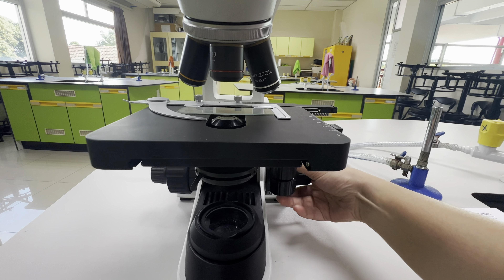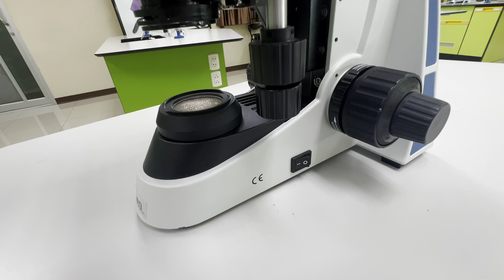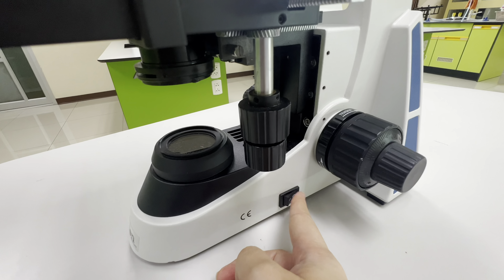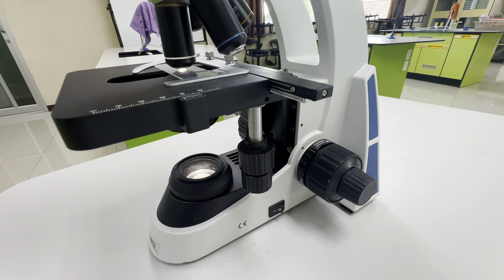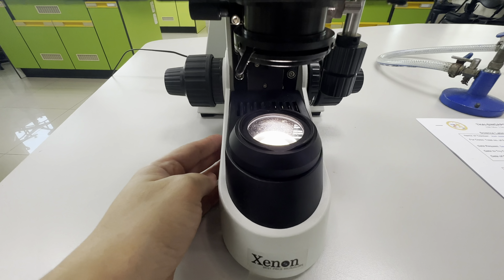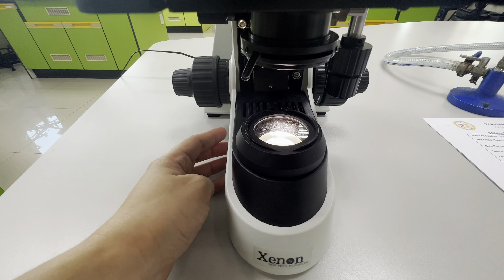This part of the microscope is what we call the coarse adjustment knob. This knob is used to move the stage up and down. This is the power switch — we use this to turn on and turn off the microscope.